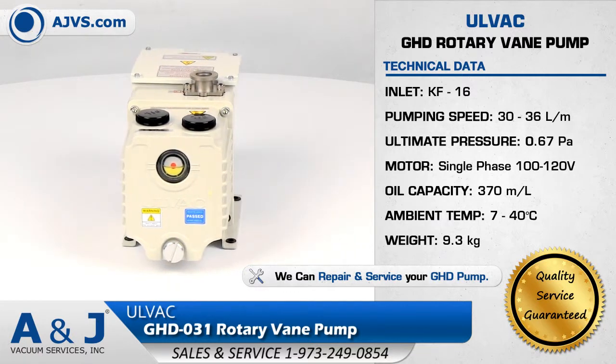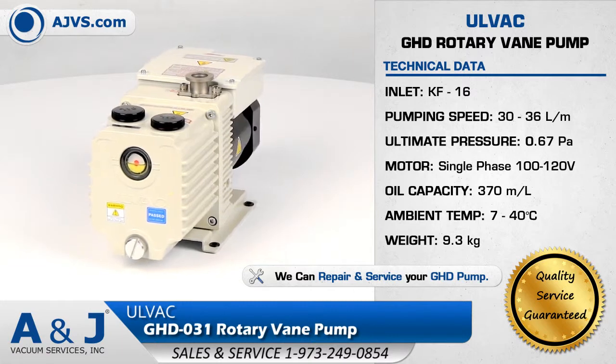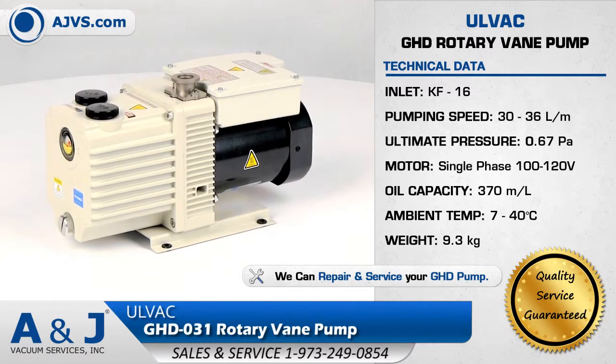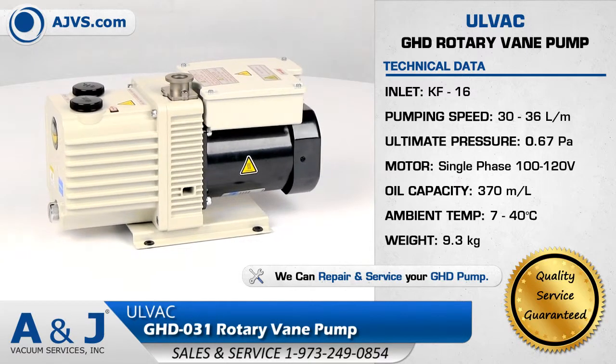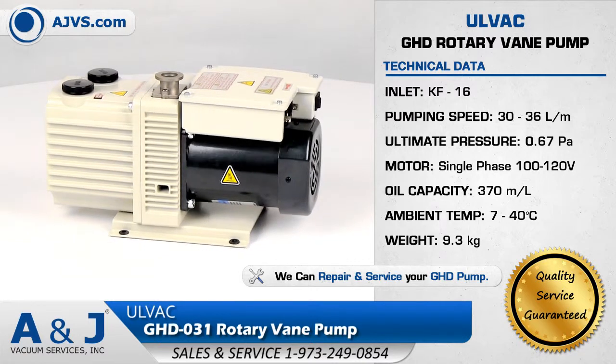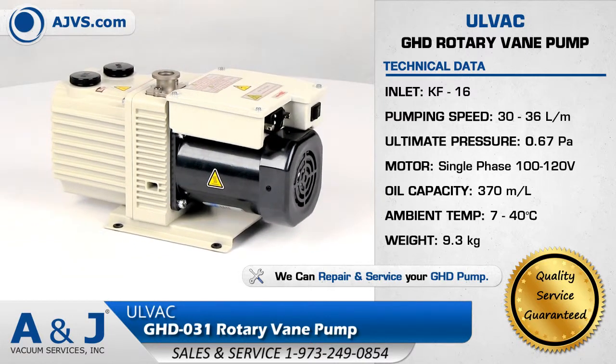The Olvac GHD has a pumping speed of 30 liters per minute and operates at low noise levels. The GHD features an integrated check valve to prevent backflow and a magnetic coupling design to prevent oil leakage from the shaft seal. It has a wide-range voltage motor and long service interval.